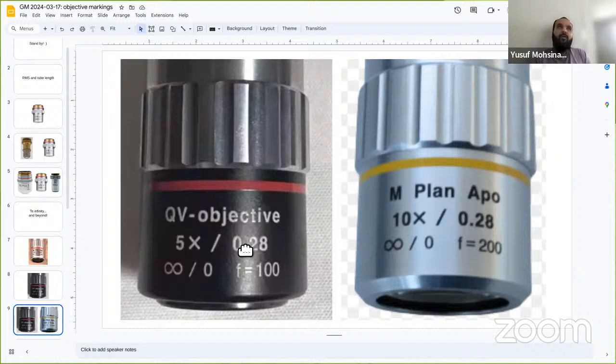Sure. Okay, so it's from the point where the lens in the tube focuses about. Yeah, internal to the microscope. So it's an internal microscope component that is going to get you to form that image plane. So it specifies how far away is that image plane. And when you think of things like the lens equations from physics, basically the further away you can put an image plane from a lens, the longer the focal length, the greater the magnification. So in this case, because we have a lens with a longer focal length, we get a bigger magnification. Great. Yeah, that makes sense now.